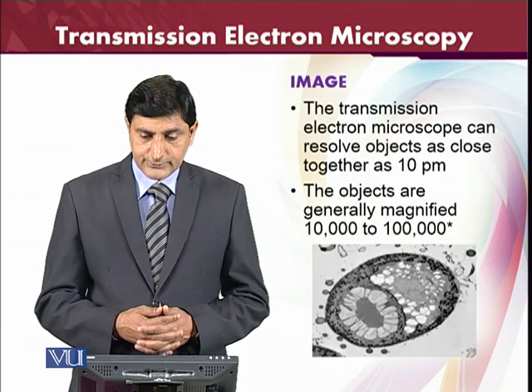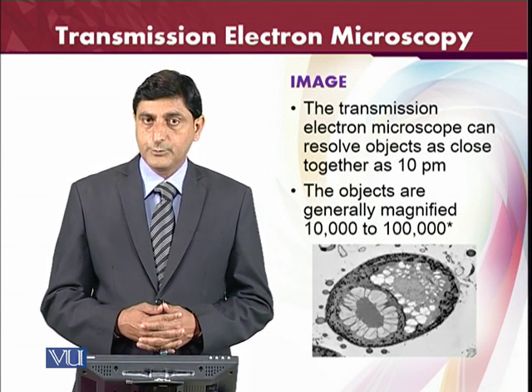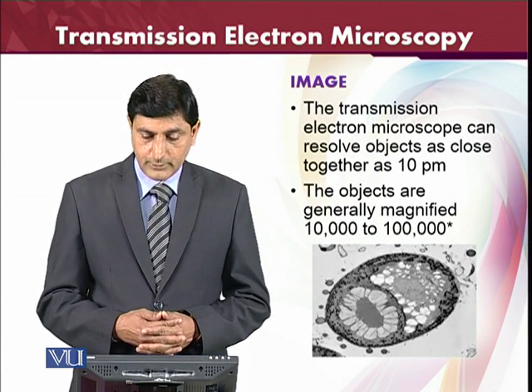The transmission electron microscope can resolve objects as close together as 10 picometers. Objects are generally magnified about 10,000 to 1 lakh times.